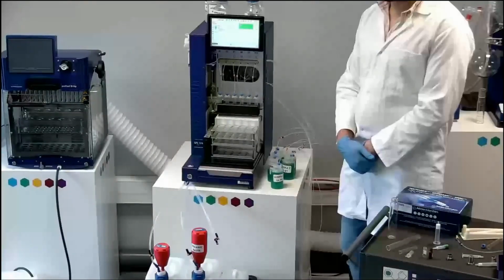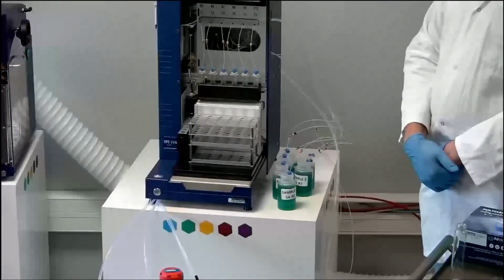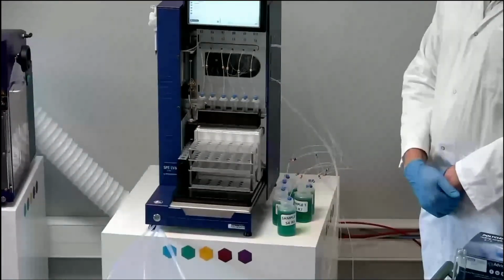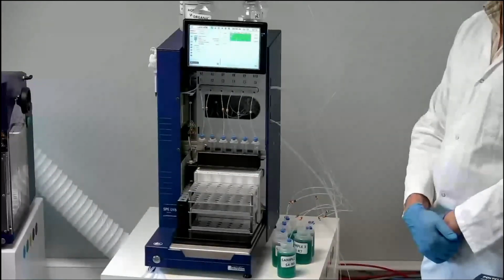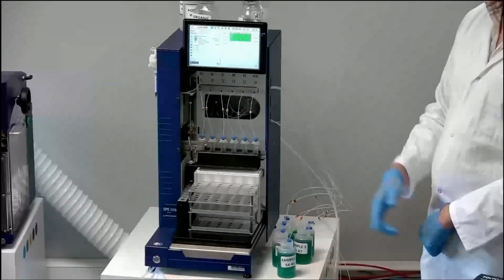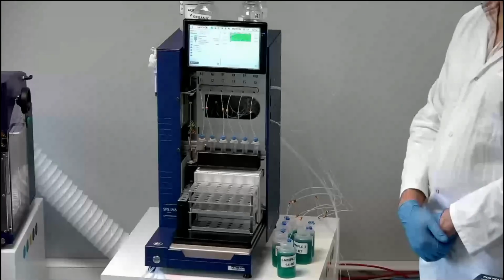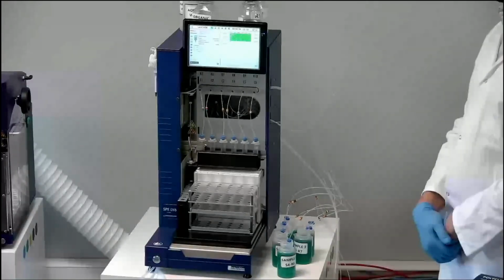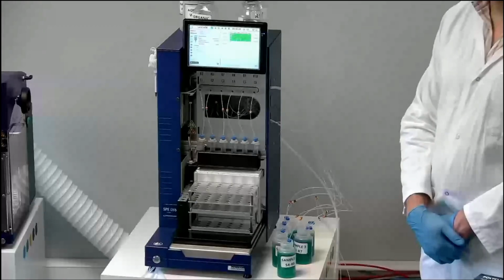For example, if you want to check the concentration of impurities in the washing step, to be sure that you don't have the molecule of interest inside your washing steps, I can indicate in my method that I want to collect the washing step in test tubes in the rack.